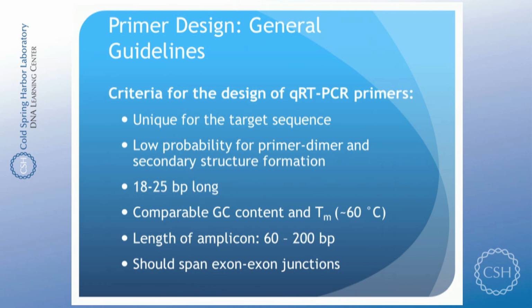Secondly, it's beneficial if the two primers you design are not prone to primer-dimer formation. Otherwise, it could easily destroy your reaction. And they also should not form any secondary structures if possible, because again, annealing will be inhibited.